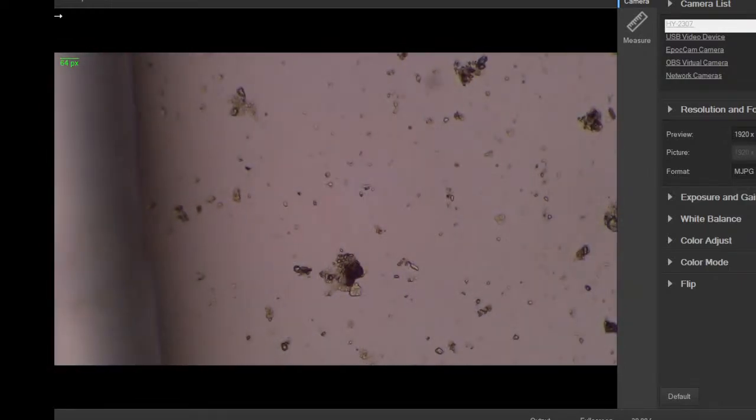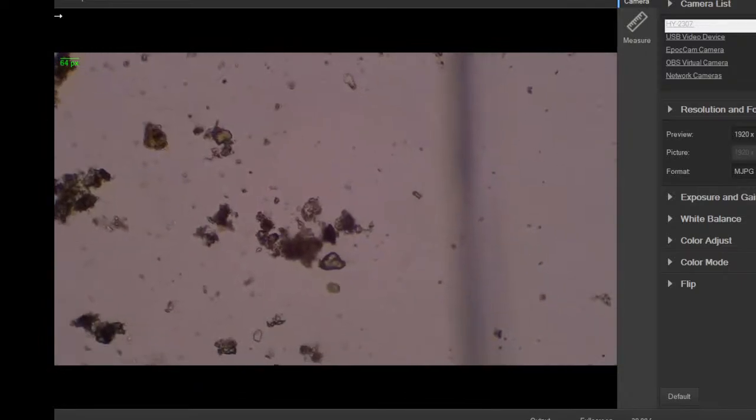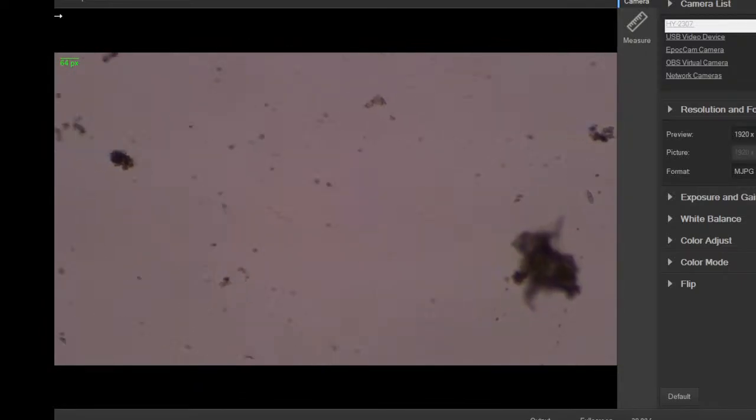single cell green character. So that would be a little photosynthetic flagellate. Very small though. There's a common one in culture. If you take a biology class or whatever, called Chlamydomonas, which are good sized green cells. Oh, there's a huge one through there. Whoa!